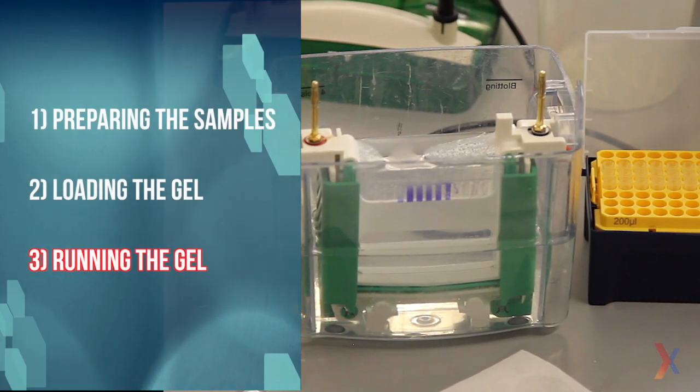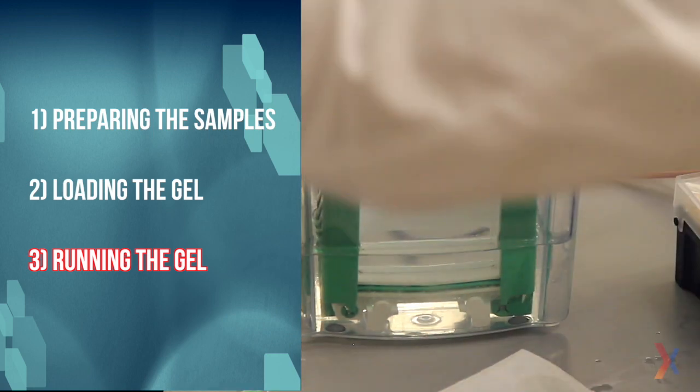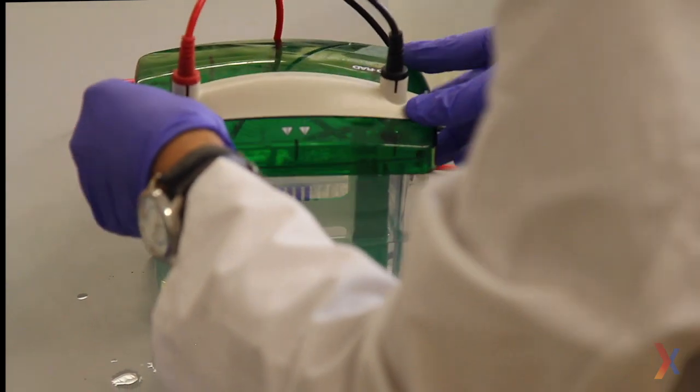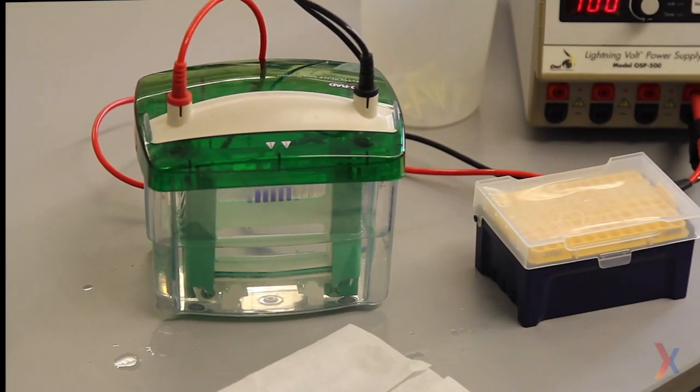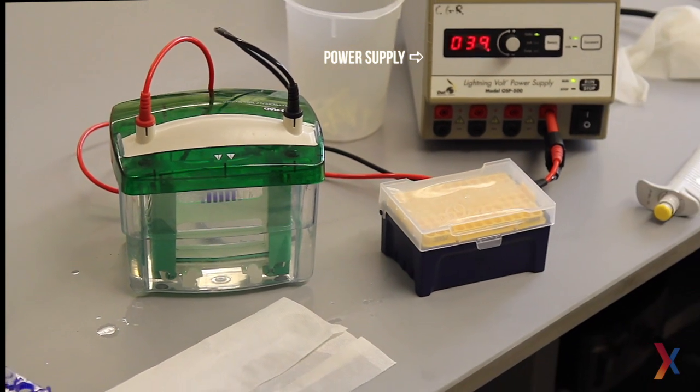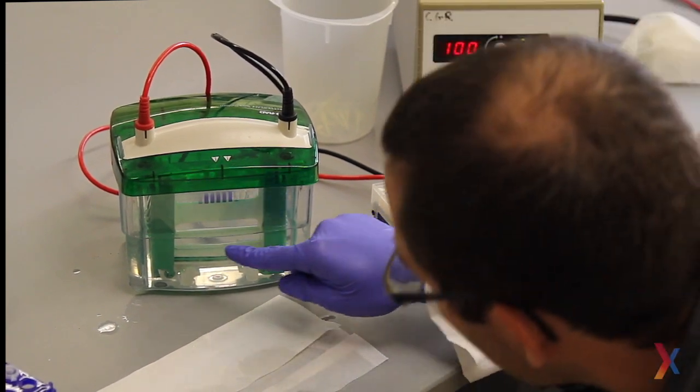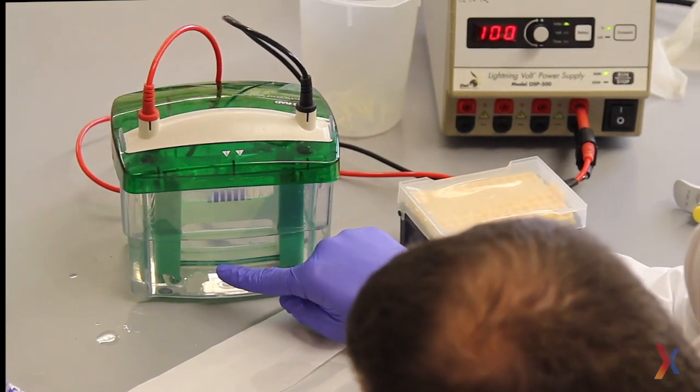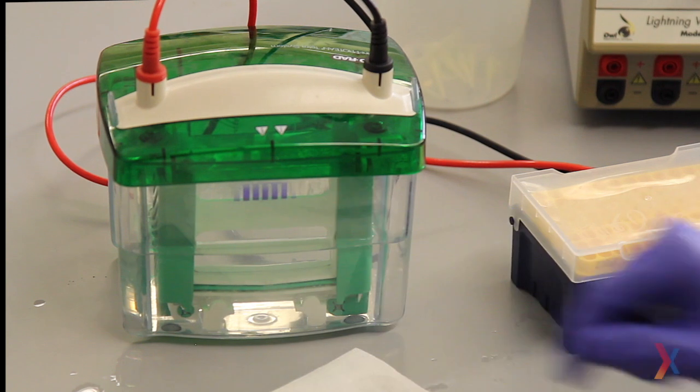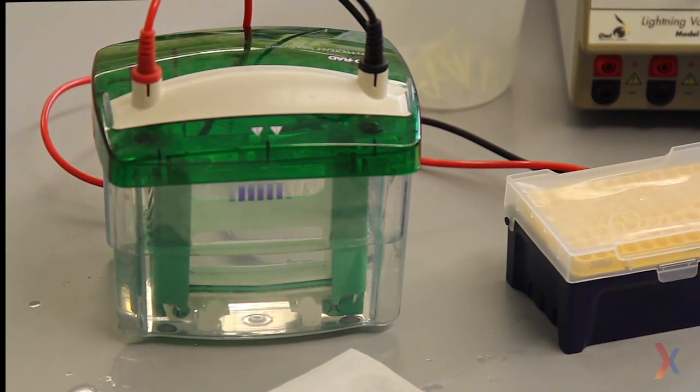Now that all four samples are added, I can add the lid, making sure to connect red to red. It's already connected to the power supply set to 100 volts. I will hit run. Check for bubbles coming up. If there are no bubbles, it means the gel is not running, but since I do see bubbles, it means the gel is running and I will now let it go for about one hour.